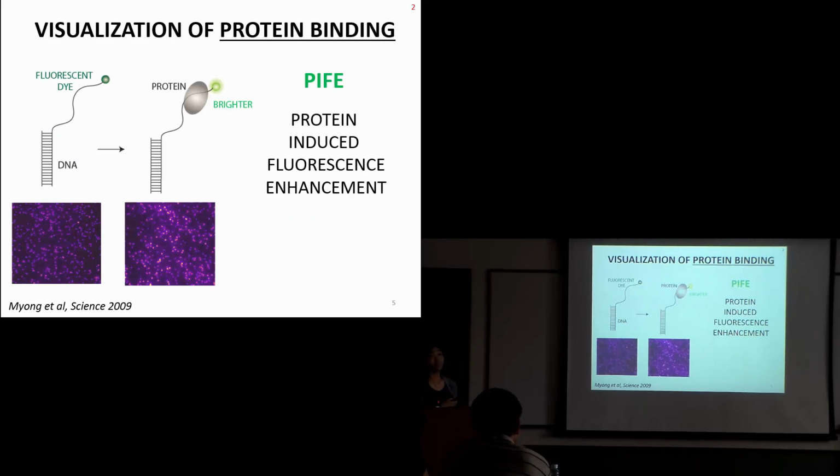All right, so this is the one-color assay I told you about. I'll introduce the name a little bit later because this is a description of what we actually observe. So imagine a DNA with a fluorescent dye attached at one end. This is supposed to depict double-stranded DNA, which should be helical, but for the picture I just show it like this. And then this can be attached to a single-stranded DNA, and the dye can be attached. And under our microscope, this is what we monitor on the computer screen.